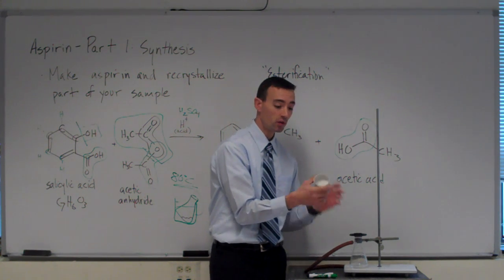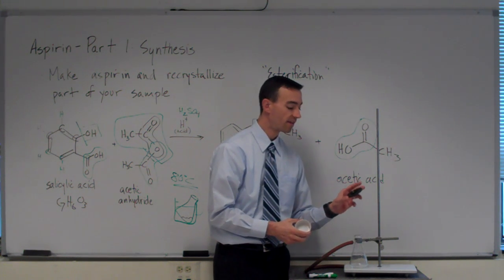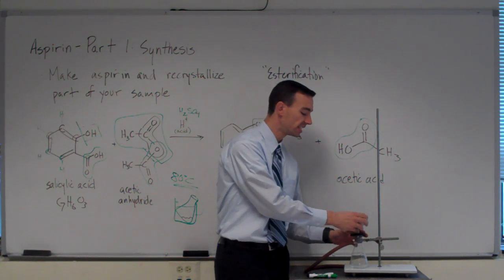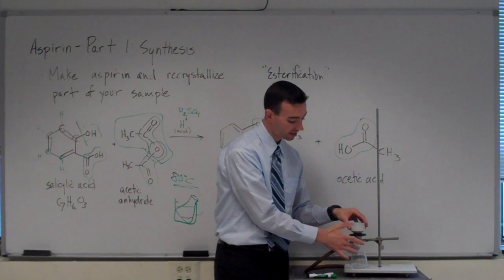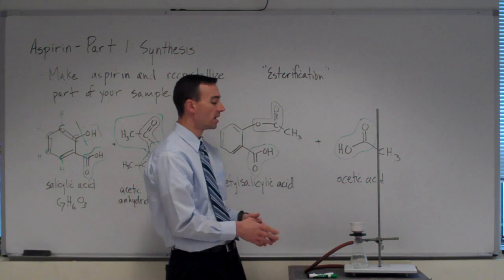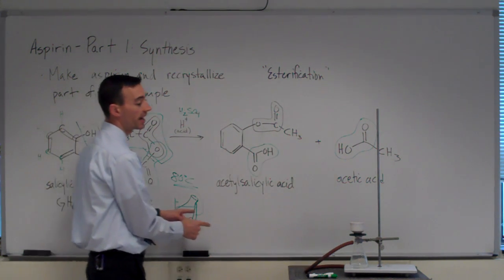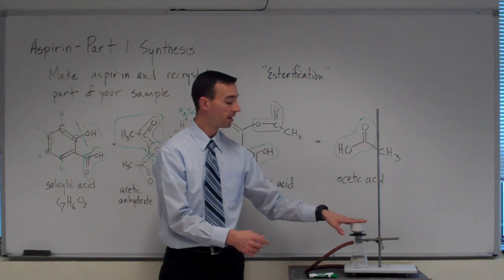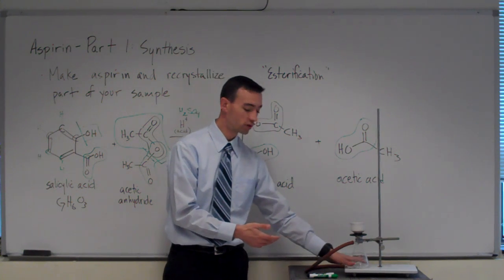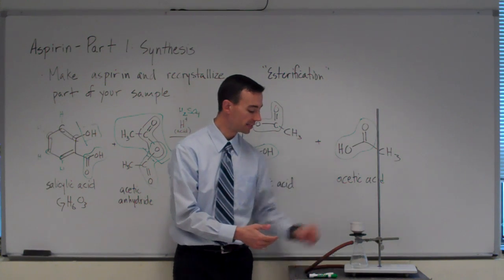We use a Buchner funnel. That's one of the porcelain funnels with many holes in the base. And then a filter vac, this little black rubber ring that gives us a seal between the two things, the filter flask and the funnel itself. So this is your filter setup. You'll put a piece of filter paper inside here and then pour the contents of your reaction mixture through the filter, and allow them to filter out the liquid, which will be collected down here. And we're interested in the solid. We want to keep that solid.